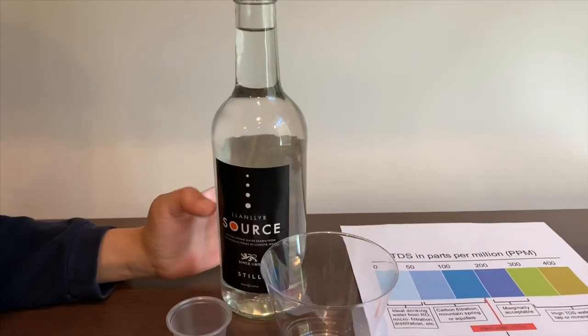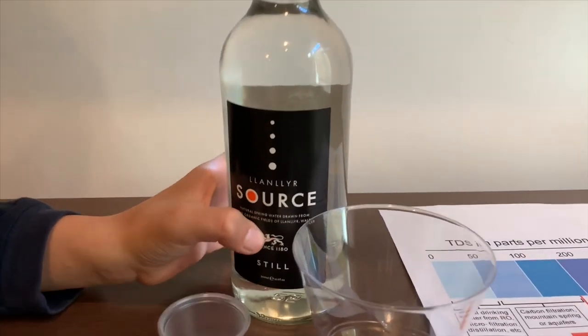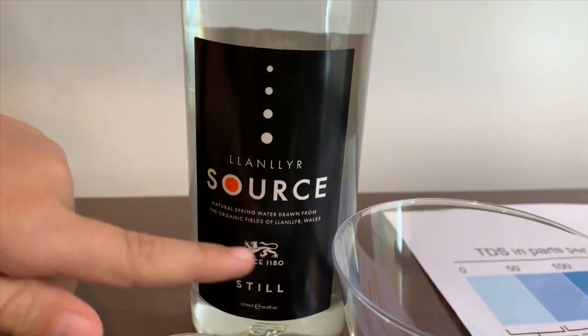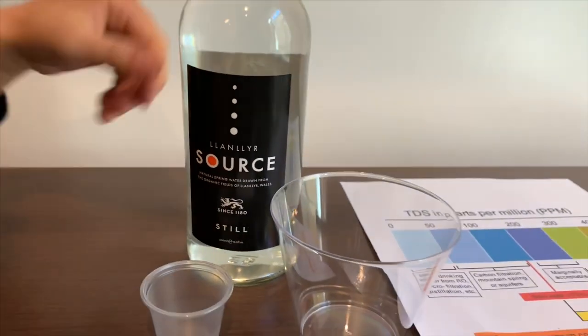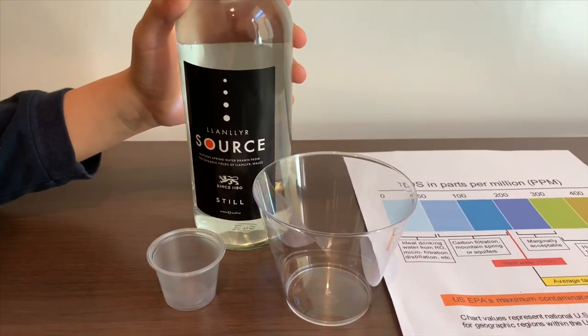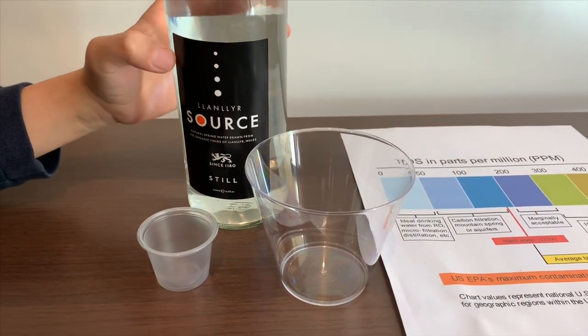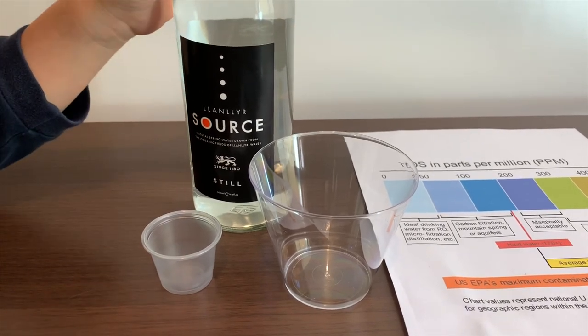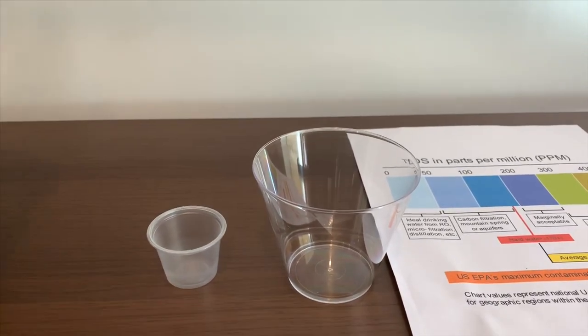This is Longlier Natural Spring water. It is sourced from Wales and it is the still version. Remember we tested another Longlier and its pH was a 4? Let's see how it compares.